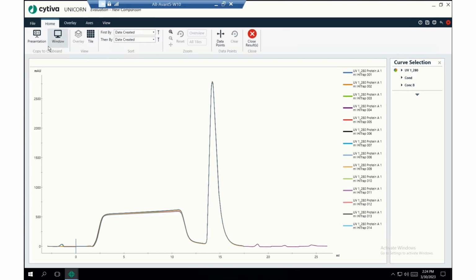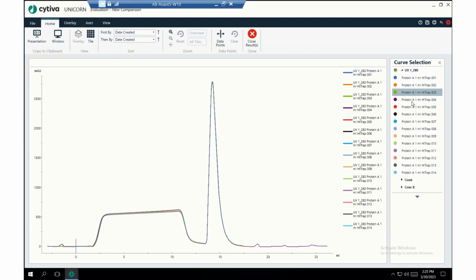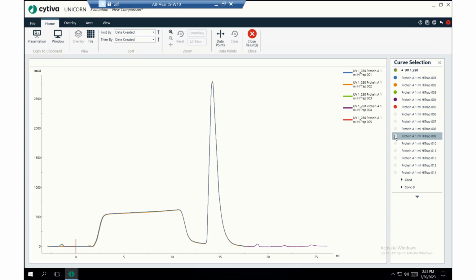My personal favorite is the tile. I'll show that to you in just a second. But while we're here, the one thing I want to show you is you can still turn on and off all the curves. These are all the UV runs. So I'm going to start removing some of these and you'll start to see the curves kind of disappear a little bit. It should become more apparent the more I get rid of. The color's kind of changing too. So anyways, let's turn them back on and let me show you the tile view, which I think looks really cool.